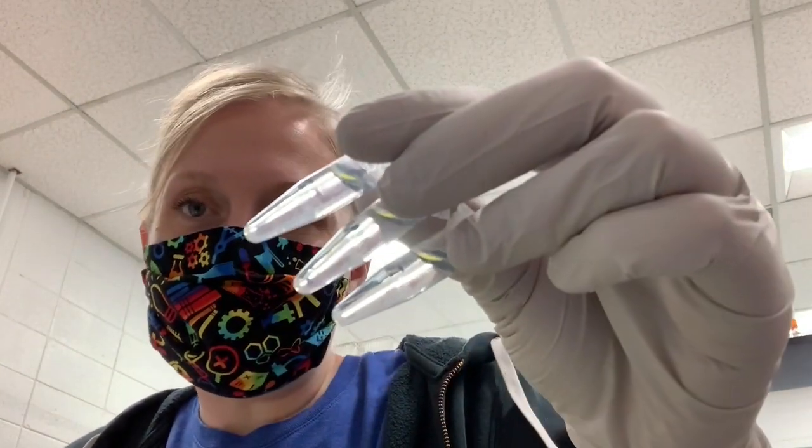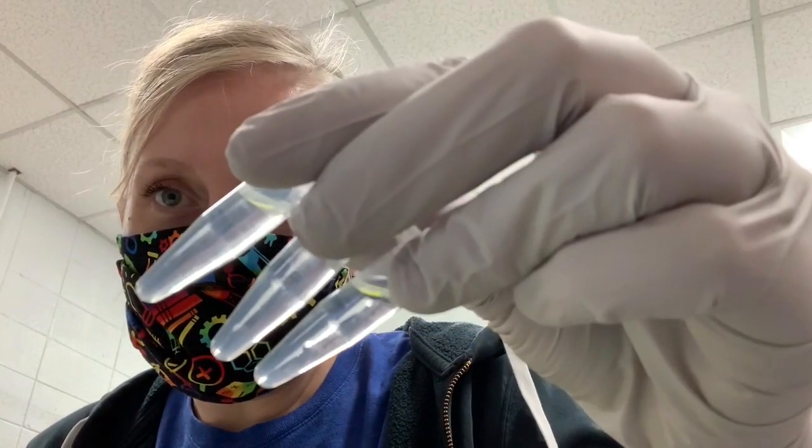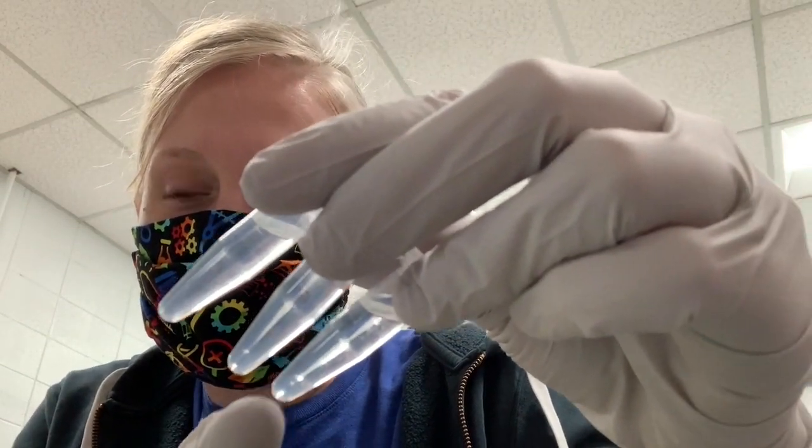Okay, so when you're finished adding the precipitation reagents for each one of your tubes, you can invert them a few times as I showed you, and you may or may not see a little bit of material. You can see it in these tubes moving around. I think it looks sort of clear and gel-like, but sometimes it will look a little bit white or cloudy.